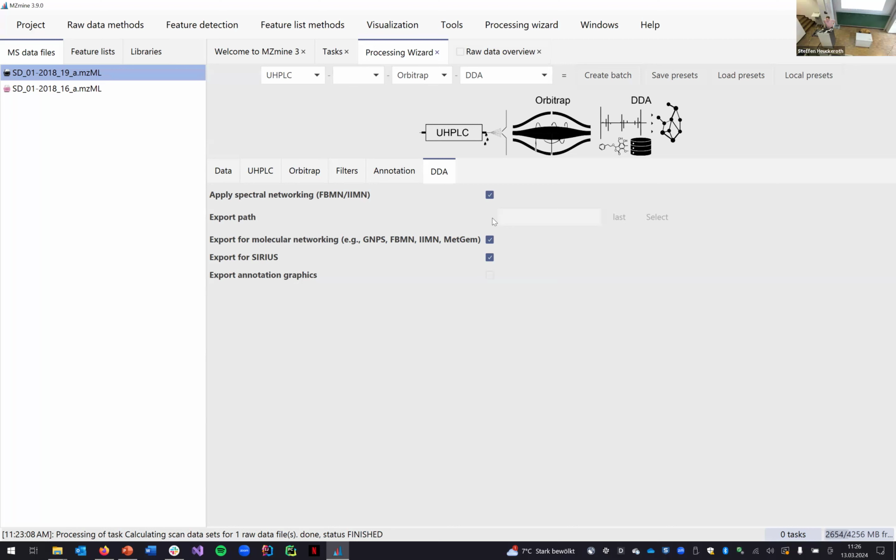I have the same issue because we came from the same school, and I had the same question at the Prague workshop to Daniel. And Daniel strongly suggested that I stop using switching mode, because you are killing the instrument. Although these instruments are designed so that you can do switching mode, his experience is that you can kill the instrument. He has already seen Orbitraps being damaged by too much switching mode.